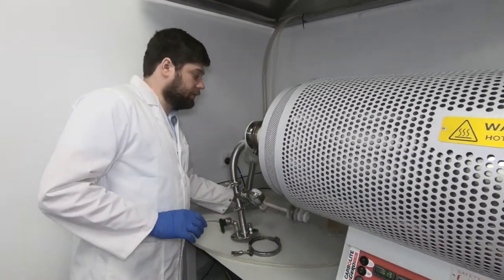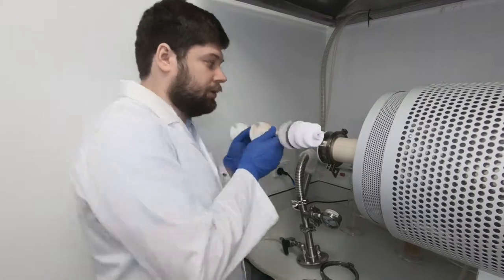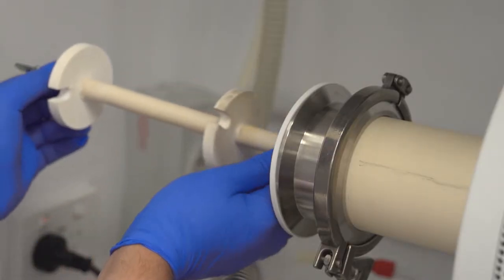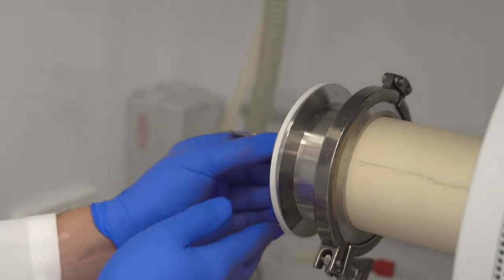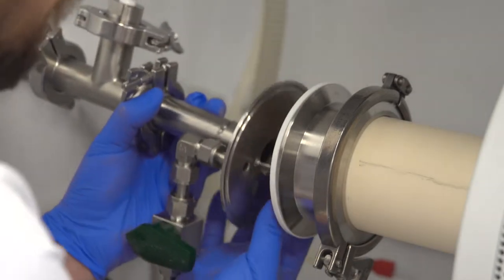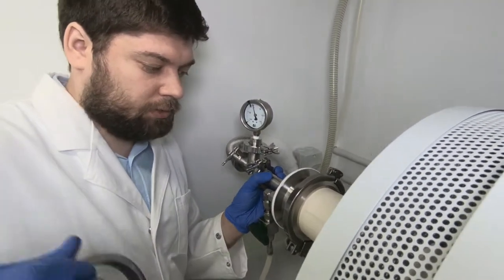Now our furnace is ready to be sealed. First of all, we use this thermoradiation shield. It's very important part because it prevents our end seals from overheating. We put it inside and then use this end seal and close this out.